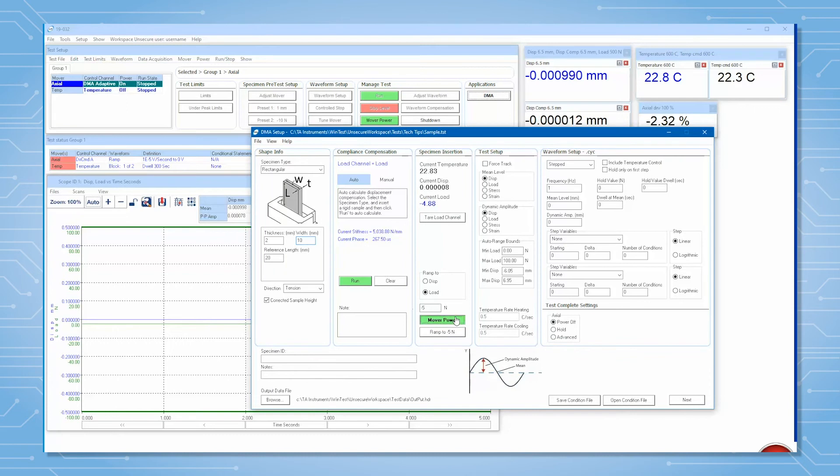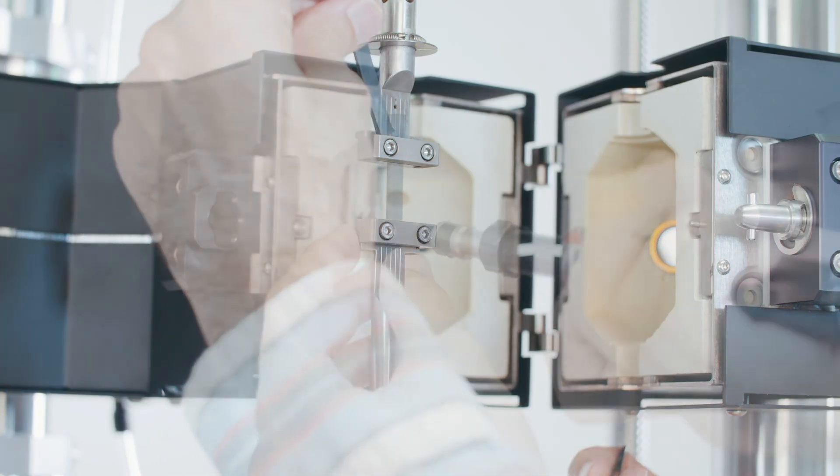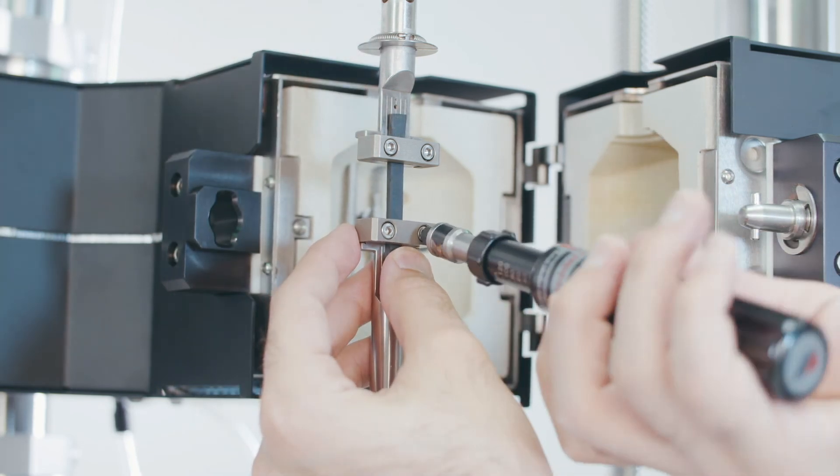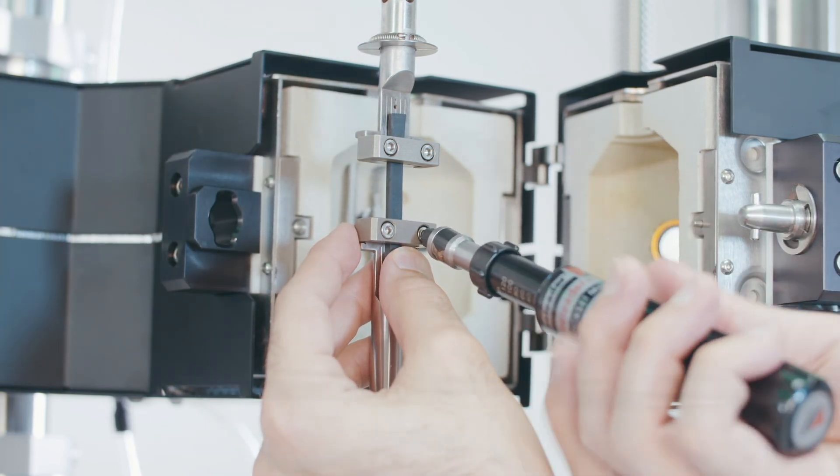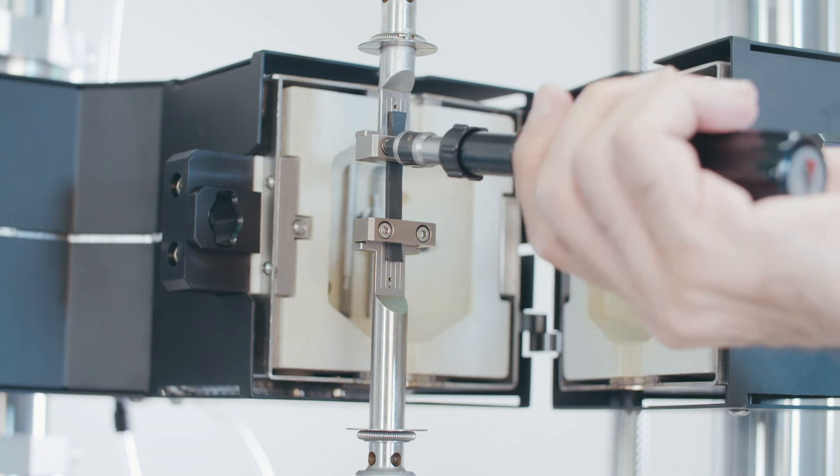Turn the power off. Mount your sample by tightening the bottom screws first with a torque wrench. Tare the load before tightening the top screws to tare the weight of the lower grip and the sample.